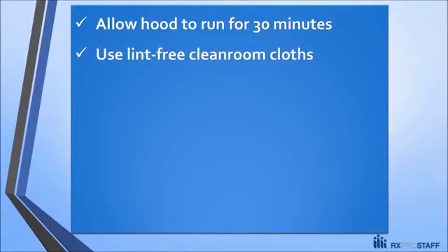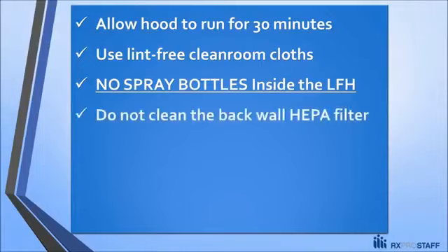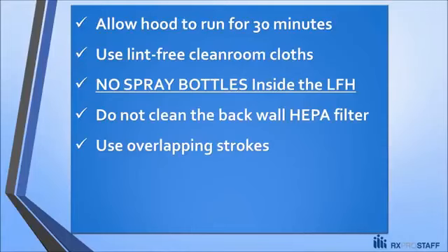Only specially designed, lint-free, clean room wipes should be used to clean the hood. Do not spray any liquid in or directly onto the laminar flow hood. Only spray liquids onto the cleaning cloth, and only while facing away from the hood. Do not clean the back wall HEPA filter, and always use overlapping strokes when wiping.